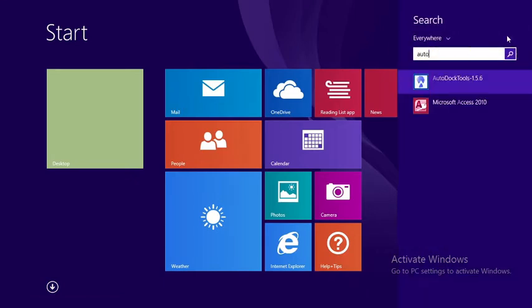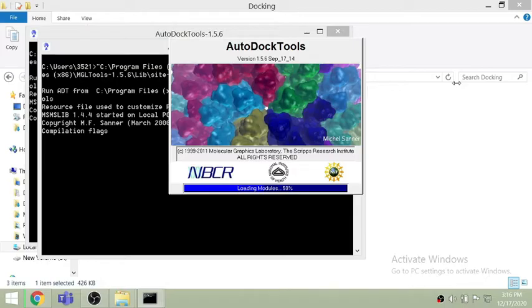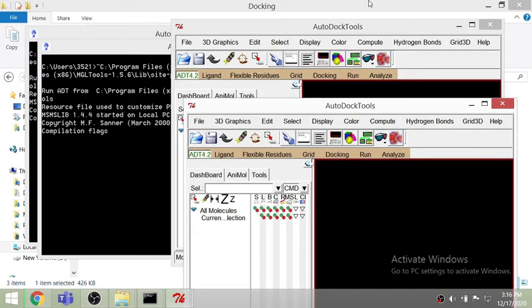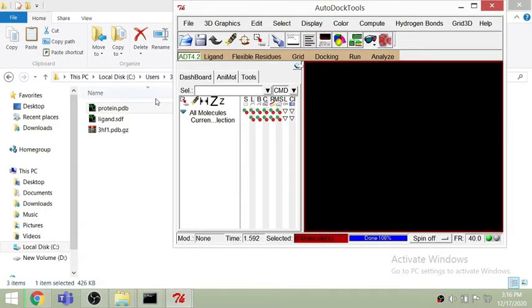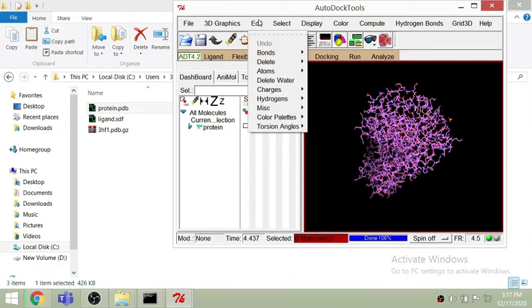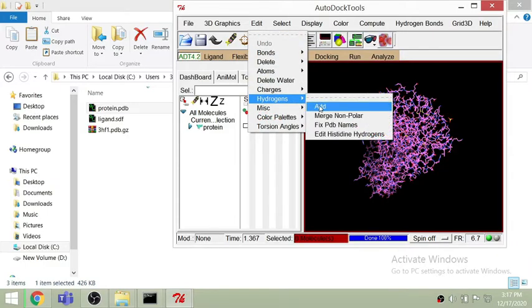Now, go to AutoDock Tools. You can see it is loading all the modules — it will take a few seconds and now it's done. This is the GUI of AutoDock. I am just dragging the protein PDB file and it will load. You can see it's loading the protein structure — this is the 3D protein structure. Now I am deleting the water molecules because they will decrease the affinity of the interaction between the ligands.